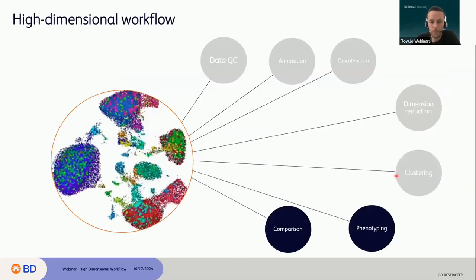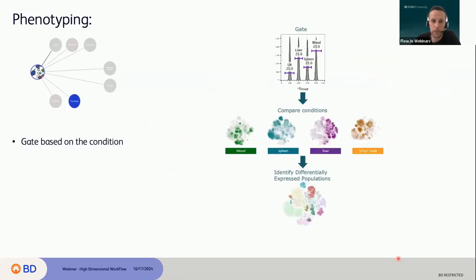All right, so we did our dimensional reduction and clustering algorithm. So now let's look at the data. In the phenotyping step, because we assigned annotations, and really that was the whole goal of annotation here in FlowJo, we're going to transform those keywords into a parameter in FlowJo.